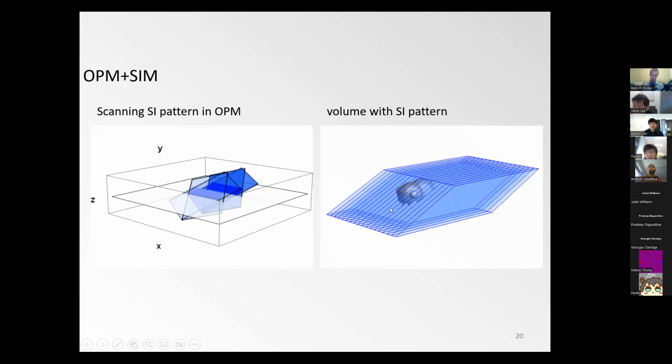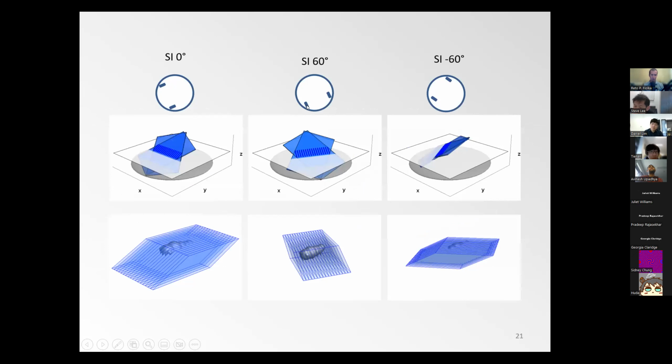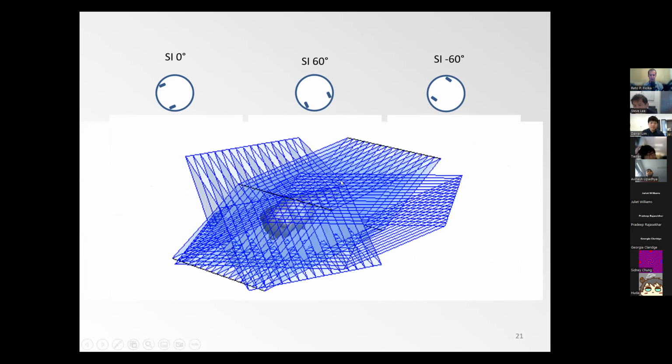So this would, in capabilities, maybe be similar to what you can do with the lattice. However, what you now can do is also rotate this excitation pattern in the pupil. So nothing prevents you from turning it by plus or minus 60 degrees. And that is something, as detailed before, that would be rather difficult with a conventional light sheet because you would need to add more objectives. But here it turns out you can just rotate it in the pupil and as such acquire volumes under different orientations of the structured light sheet as required for SIM. And then you can stitch those volumes together, and where they have mutual overlap, you could do a SIM reconstruction that is kind of isotropic in all lateral directions.